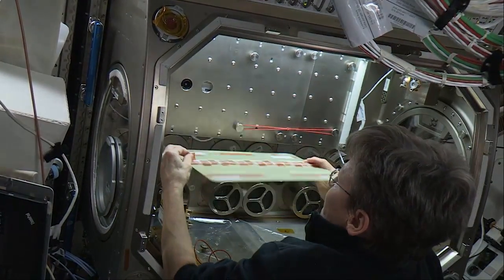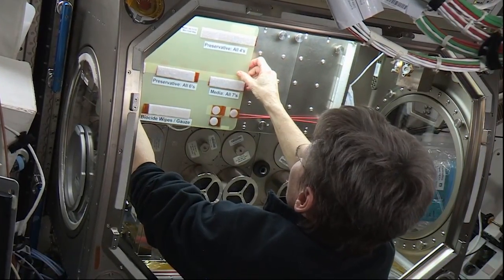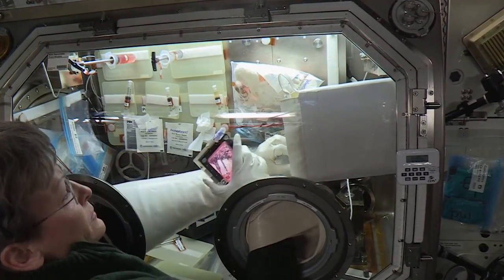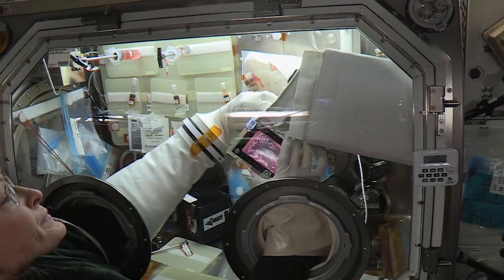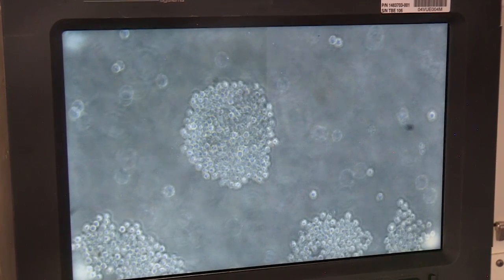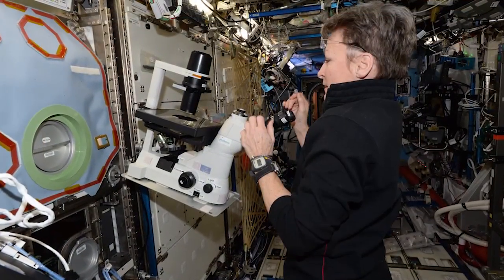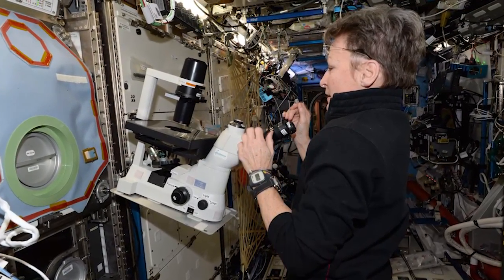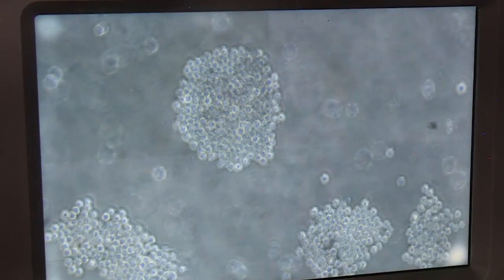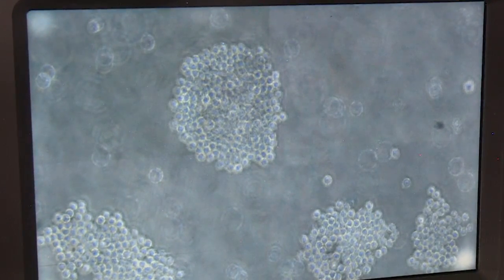One experiment fired up this week was the Microgravity Expanded Stem Cell Study, taking place in the Microgravity Science Glove Box. NASA's Peggy Whitson activated the investigation, which is looking to utilize the microgravity environment on station to accelerate the expansion of human stem cells, something that could be useful in a lot of medical treatments on Earth. The cells cultivated on station will be used in clinical trials to measure their effectiveness in treating disease, and could improve therapies for stroke patients or even provide insight on how to help prevent and treat a number of cancers.